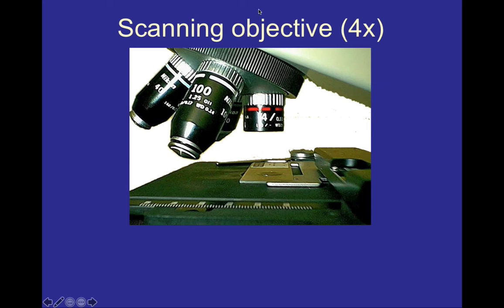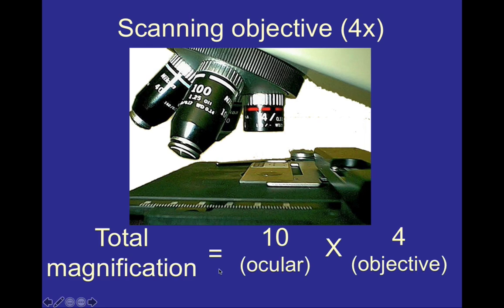The first of our objective lenses is the scanning objective lens, which has a magnification of 4 times. For our purposes, this is the one with the red line, and you can see 4 written on this objective to indicate 4 times magnification. To get the total magnification, we remember that we are also looking through the ocular lens. We take the ocular lens magnification of 10 and multiply it by 4, giving us a total magnification of 40 times. So the picture we're viewing is 40 times as large as it is to the naked eye.